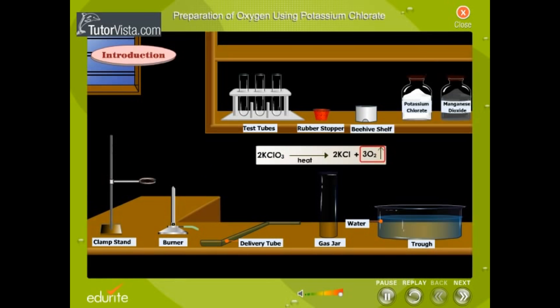Potassium chlorate on heating liberates oxygen gas. This being a very slow reaction, manganese dioxide, a catalyst, is used.